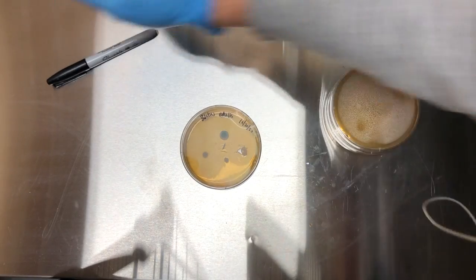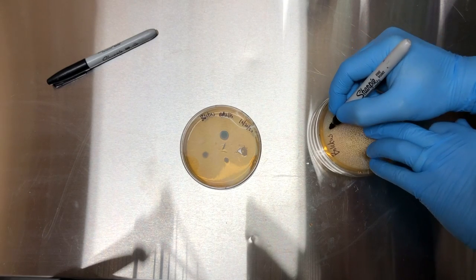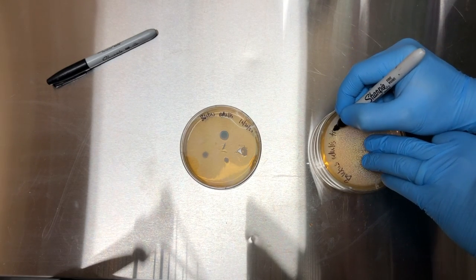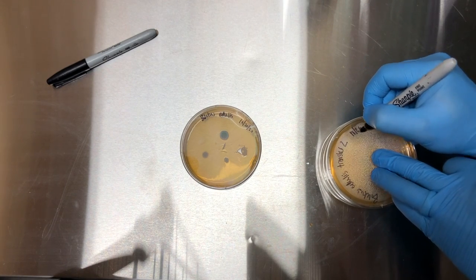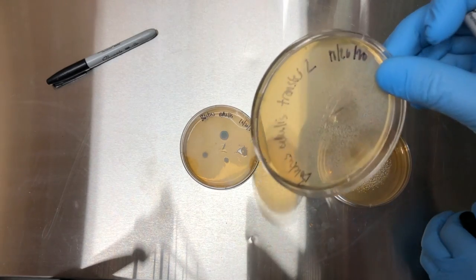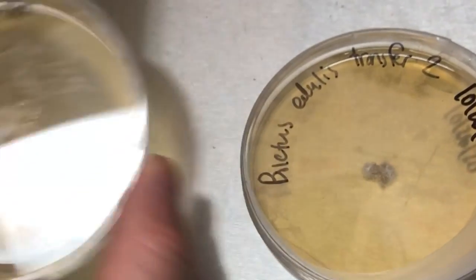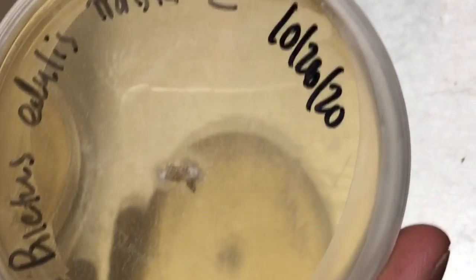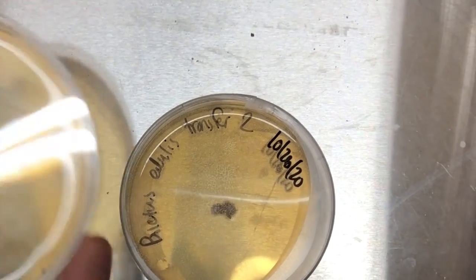I'm just going to label these. Hopefully we get some nice isolates. This is 72 hours after the transfer and you can see we've got some clean Boletus edulis mycelium. As this grows out, I'll be expanding it onto more plates and getting it into a liquid culture.